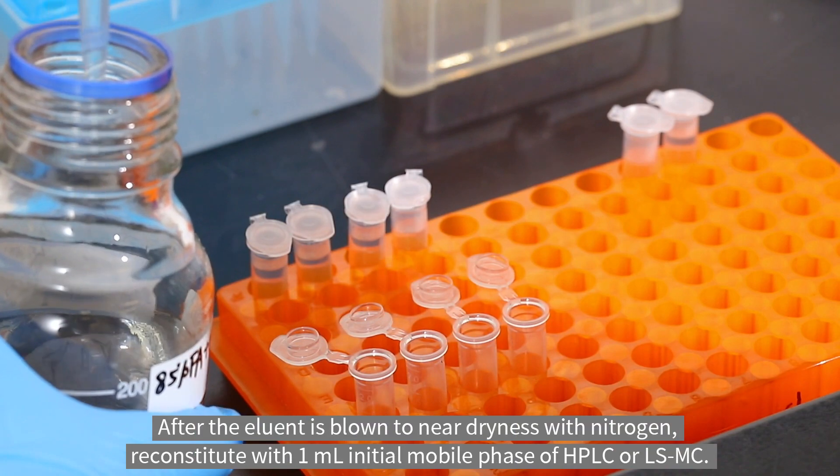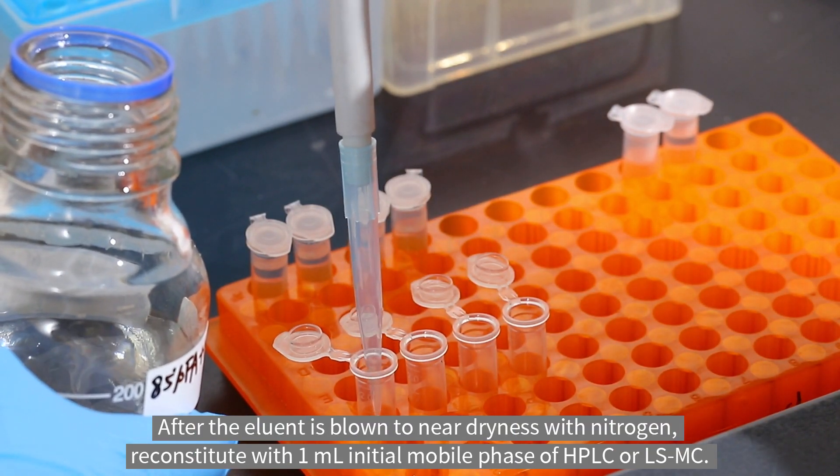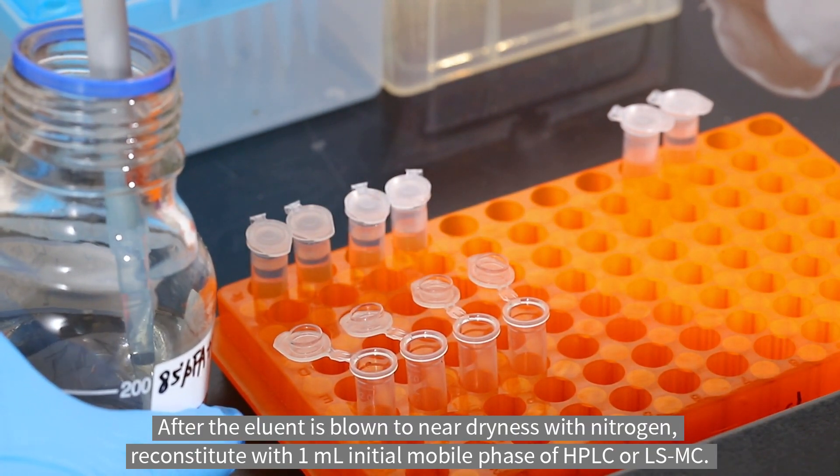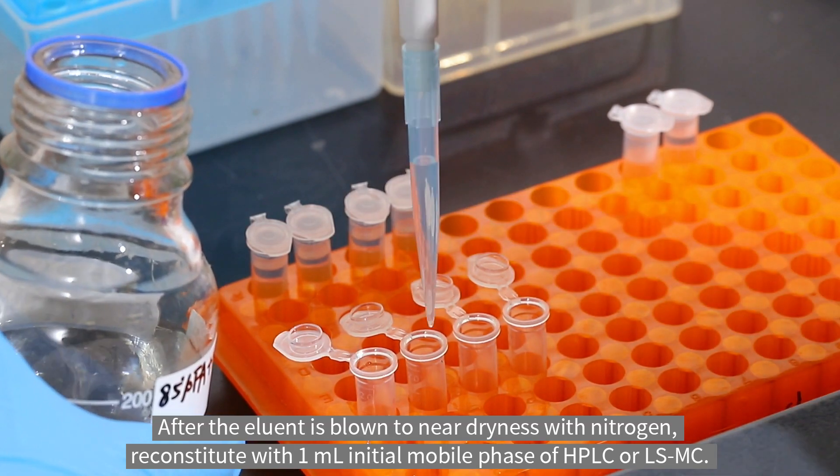After the eluent is blown to near dryness with nitrogen, reconstitute with one milliliter initial mobile phase of HPLC or LC/MS.